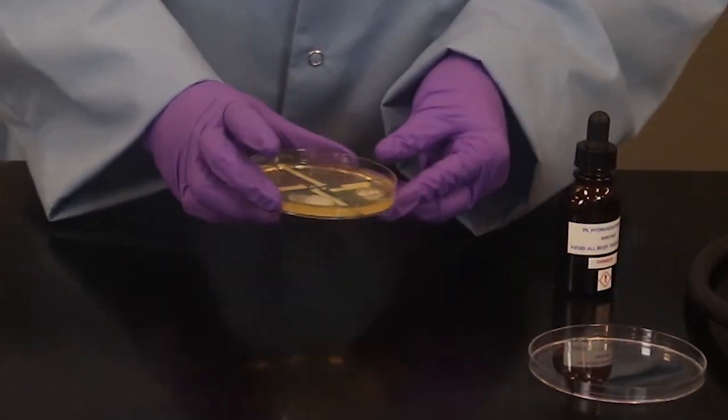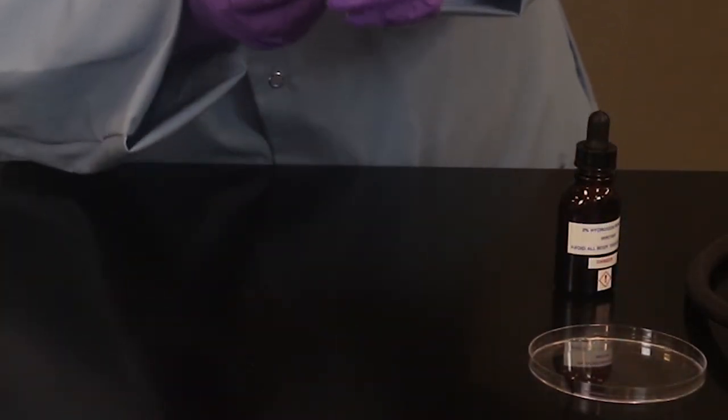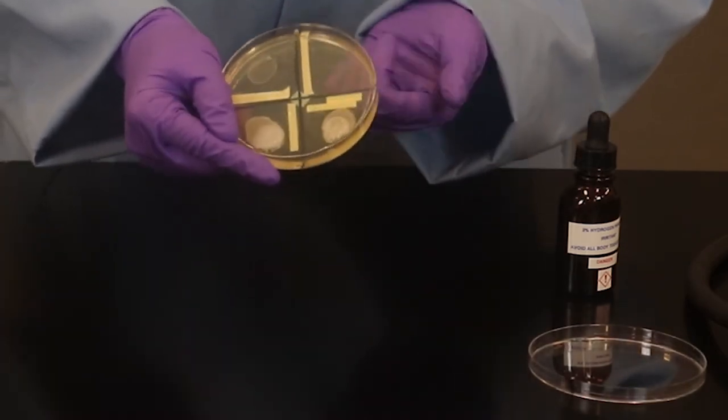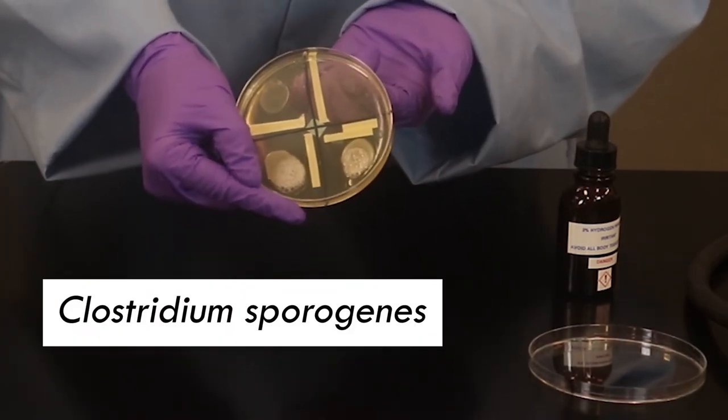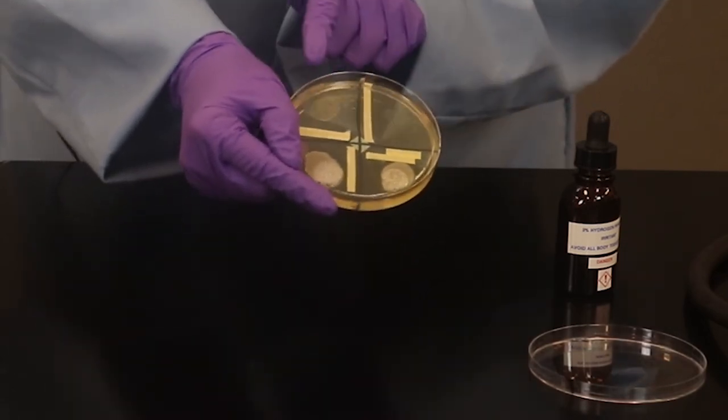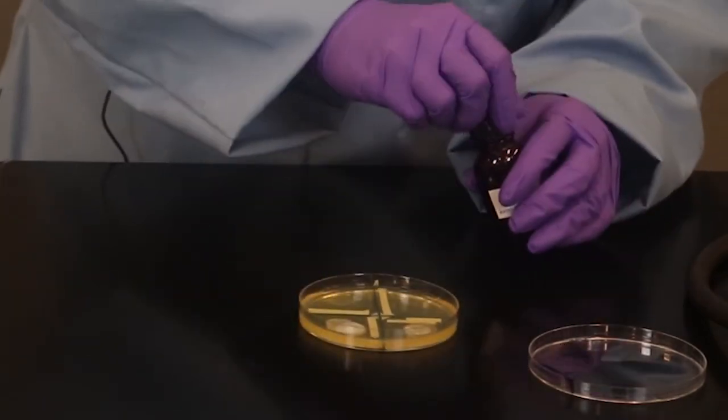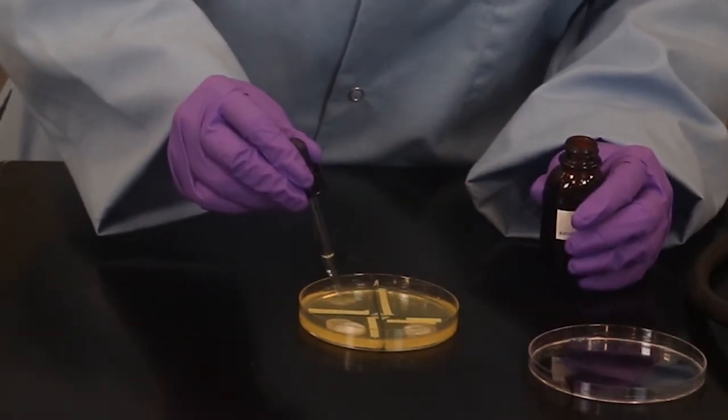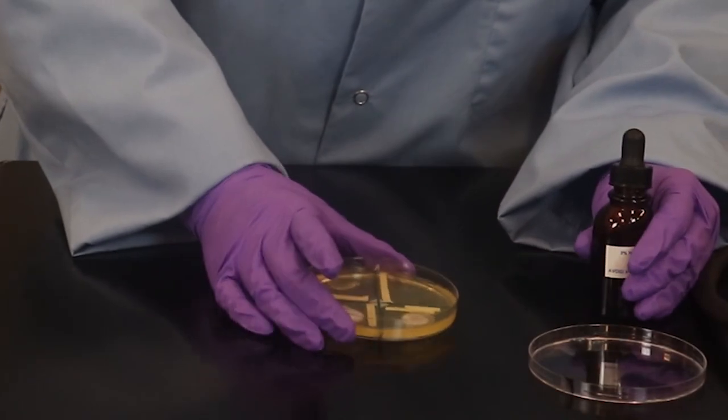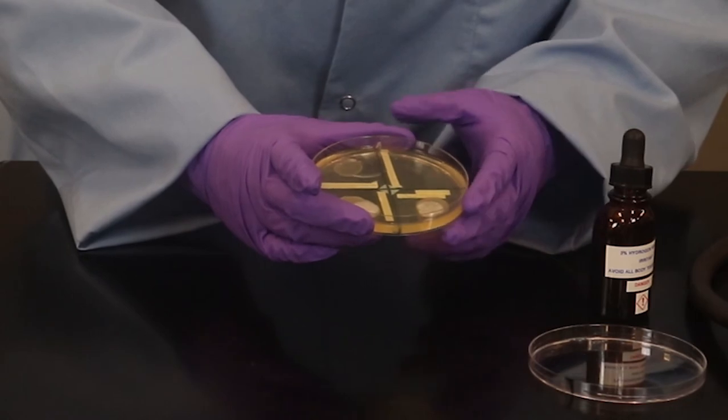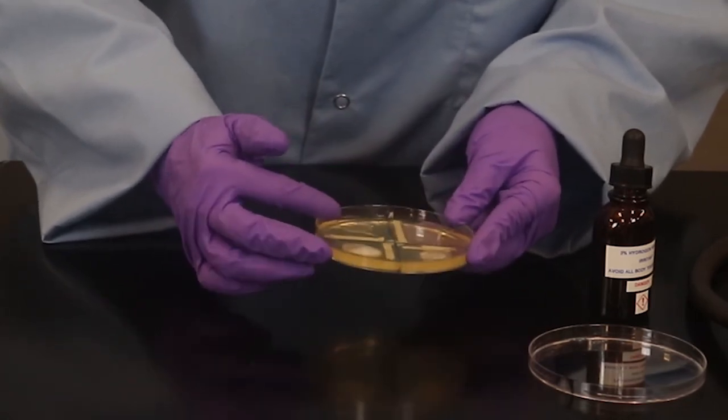And that's our Lactococcus lactis. Clostridium did not grow in an aerobic condition, so we can't test it from this petri plate. So we have one more that we can look at. Swirling some hydrogen peroxide around.